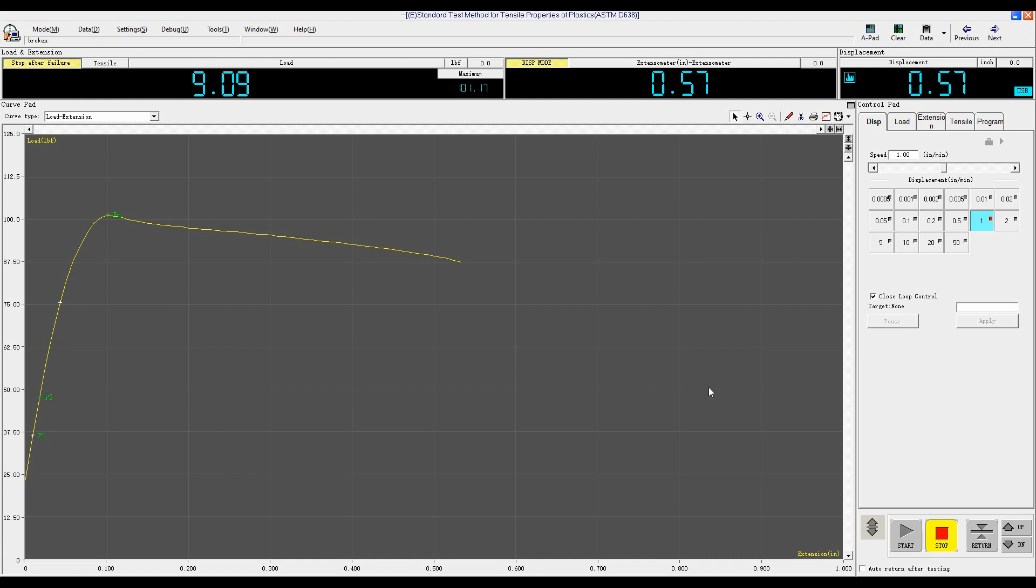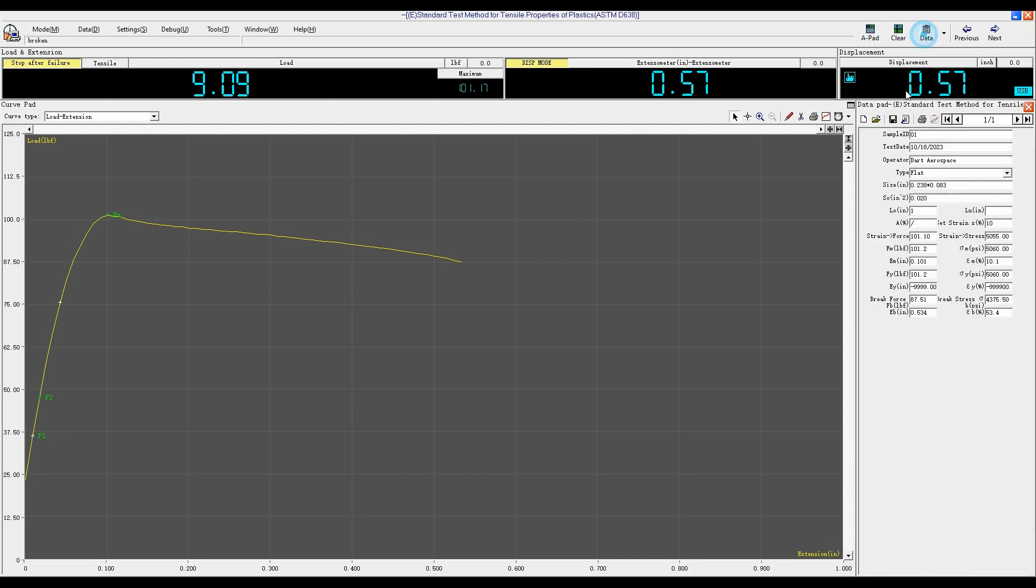The sample breaks, the software auto-stops, then click Addit to check the test result.